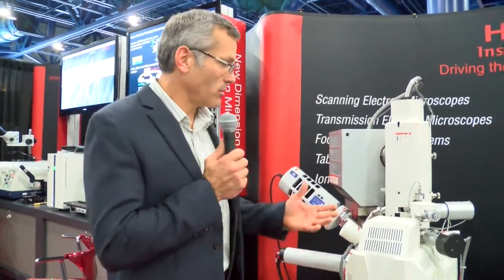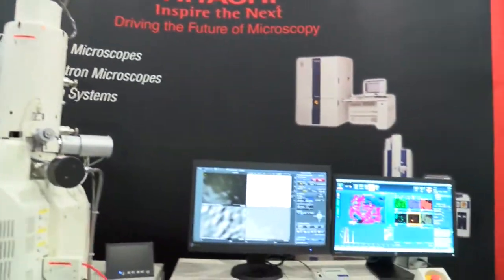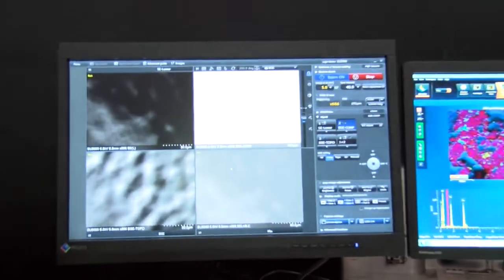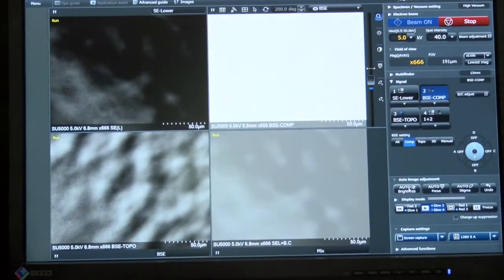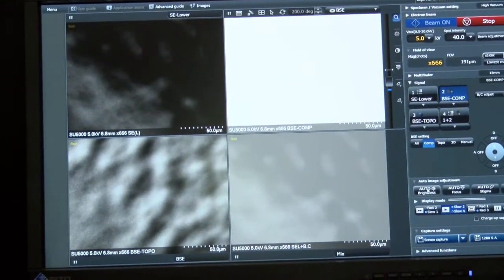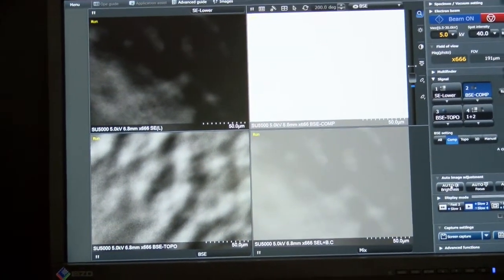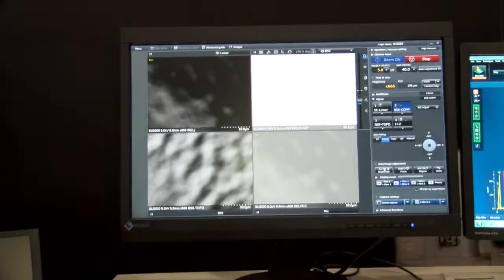We're going to do a quick demonstration on the software. One of the other key features of the SU5000 is a whole new designed interface. Mike here is going to demonstrate the capabilities of the system. We actually have four out-of-focus and out-of-brightness images here from four separate detectors.